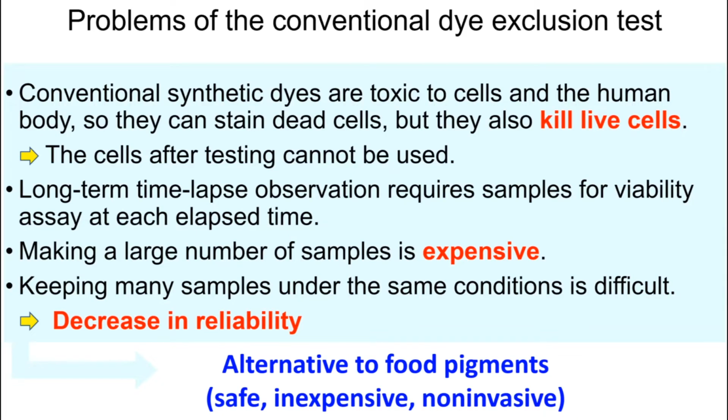It is about the problem of DET. Conventional synthetic dyes are toxic to cells and the human body, so they can stain dead cells, but they also kill live cells. Then, the cells after testing cannot be used. In addition, long-term time-lapse observation requires samples for viability assay at each elapsed time.